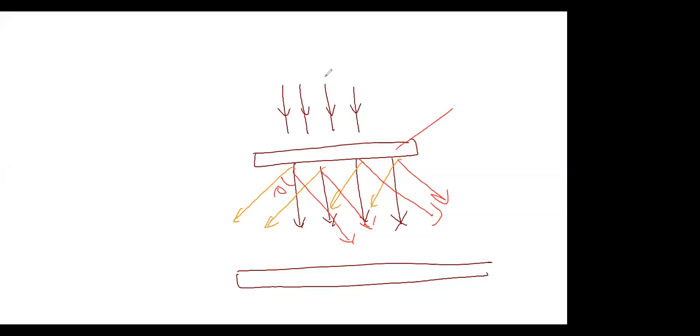So there will be X-ray generation. You can collect X-rays. You can do energy dispersive X-ray spectroscopy, right? Even here, suppose you select an area of 200 nanometer, you can say, sir, it's not localized information. You told me that you can get information about a single atom, but 200 nanometer is quite a lot, right?